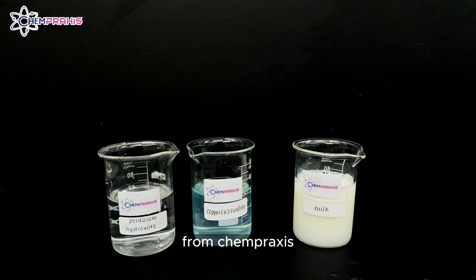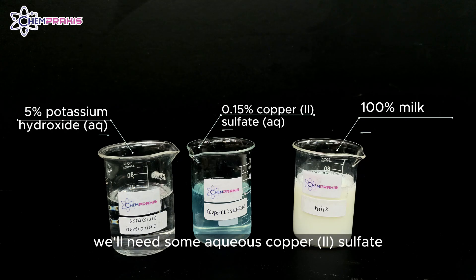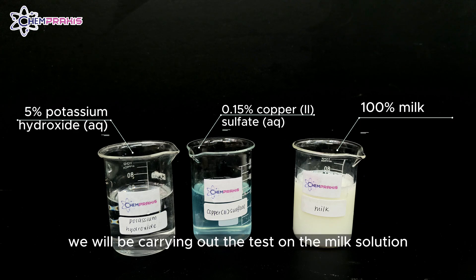Hello, we're from Chem Praxis. Today we'll be carrying out a biuret test to test for protein. To carry out a biuret test, we need some aqueous copper(II) sulfate and aqueous potassium hydroxide. We'll be carrying out the test on a milk solution which contains protein.